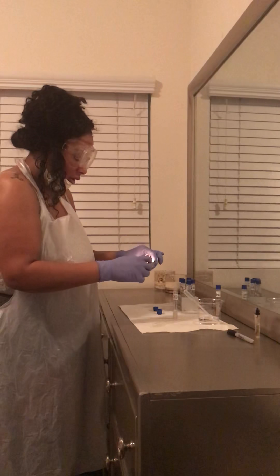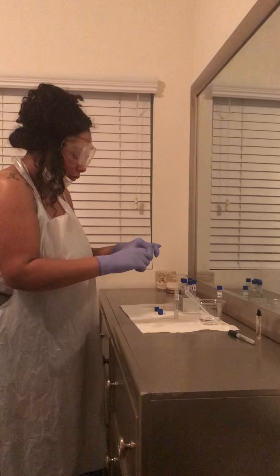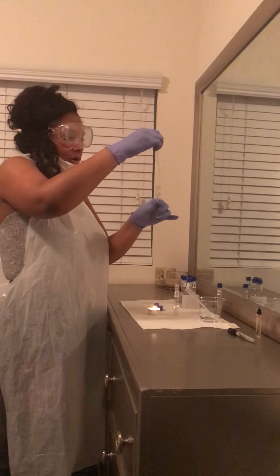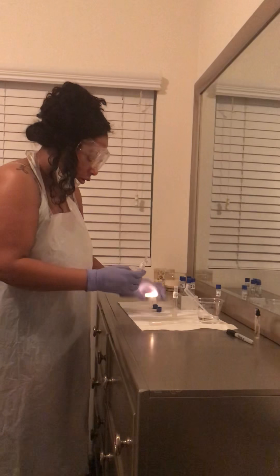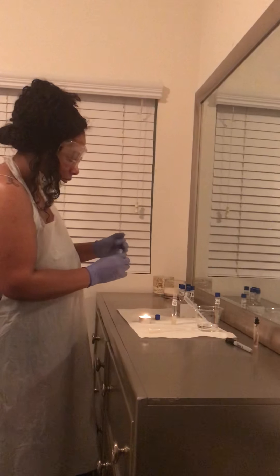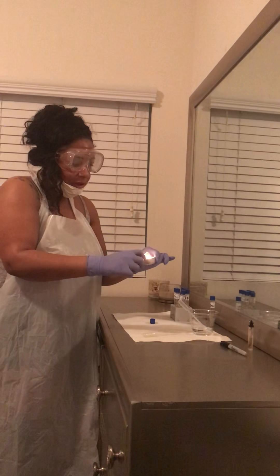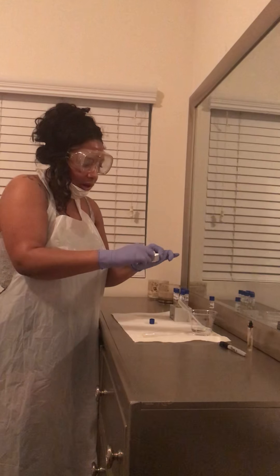Now I'm going to take it and sterilize the rim here. I'm going to add in two more drops of active culture: 1, 2. Now we're going to sterilize the rim and go ahead and close it up. Now that we are done with the active culture S. epidermis, before I close it, I'm going to go ahead and sterilize the rim, and now we're going to go ahead and close it up.